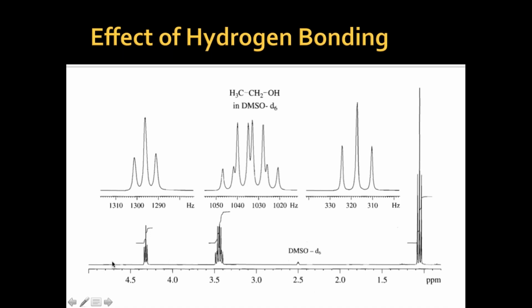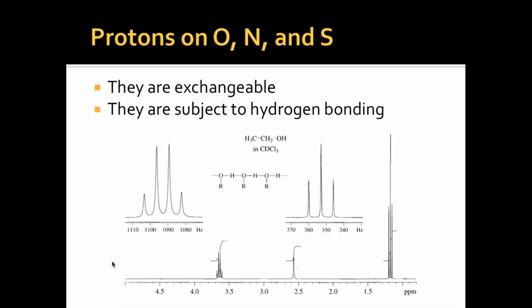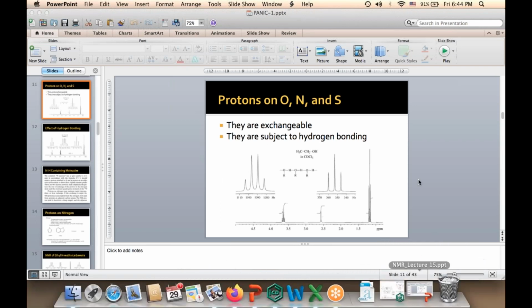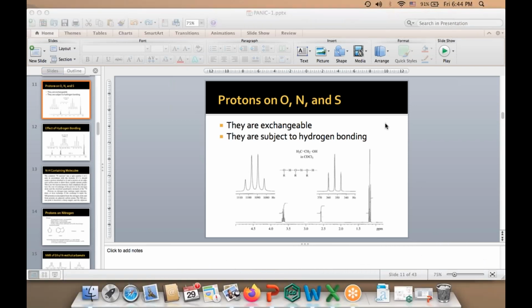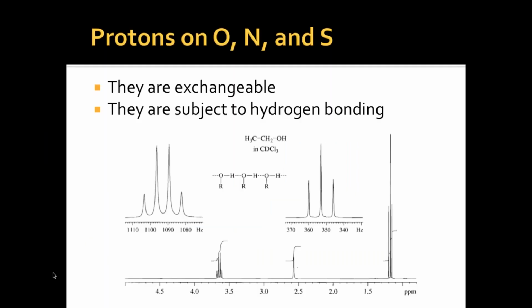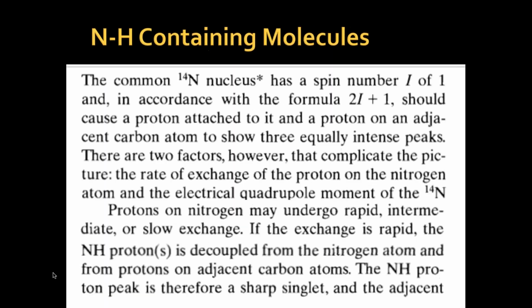So I hope I'm able to clarify the concern on oxygen, that the protons on oxygen are not the same as on the carbon, right? All right. Let's go forward. Now we discussed already the proton on the oxygen. Let's see about the nitrogen.